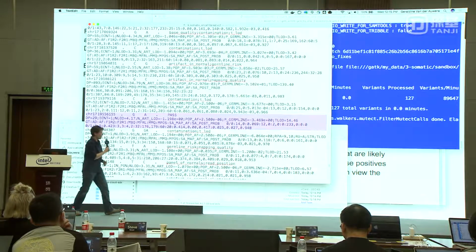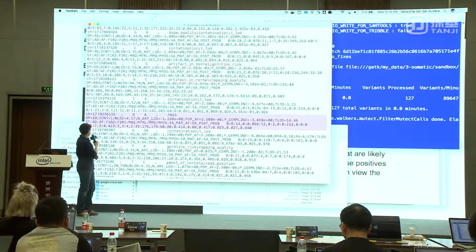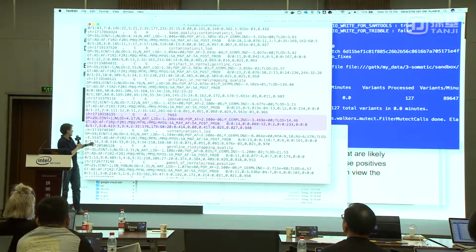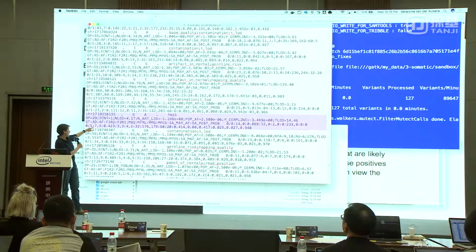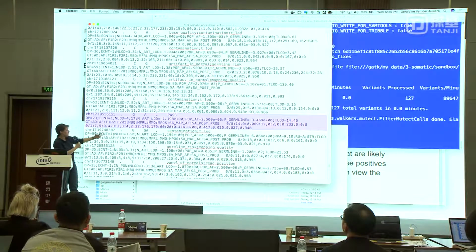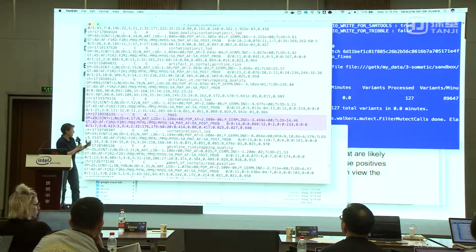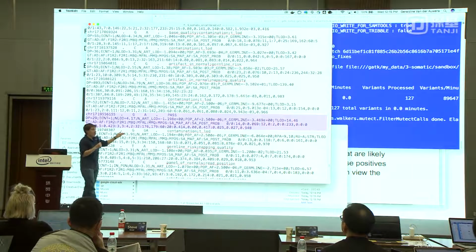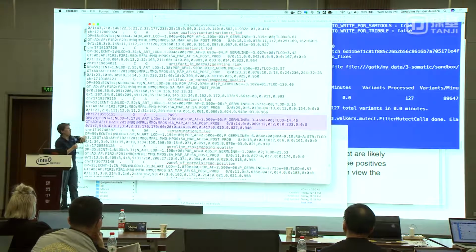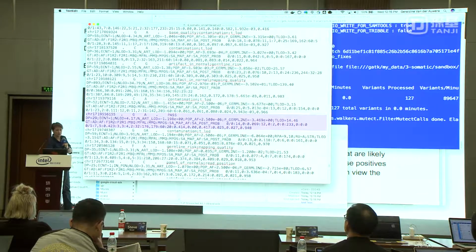We're quite happy with our determination that this is a variant. And if we look at the allele depth for the variant in the tumor, we have 7 reference and 5 alt. That's great. That's good in terms of the evidence. And because it's high enough, it doesn't get impacted by the contamination-based filter. I didn't really talk about how that was applied, did I?